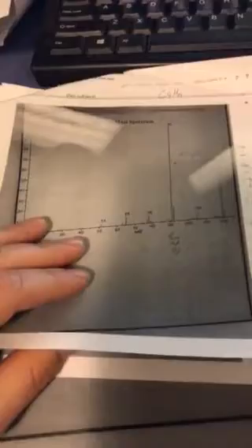Next, we will move on and use infrared spectroscopy to help notice some of the bonds in our shape. In our image, we'll notice that there's nothing in the first zone. In the second zone, there are some peaks which are indicative of sp3. In the third zone, there's nothing. And in the fourth zone, we can see a peak that's related to a carbon-carbon double bond. And then the fingerprint region, which is really not very important.